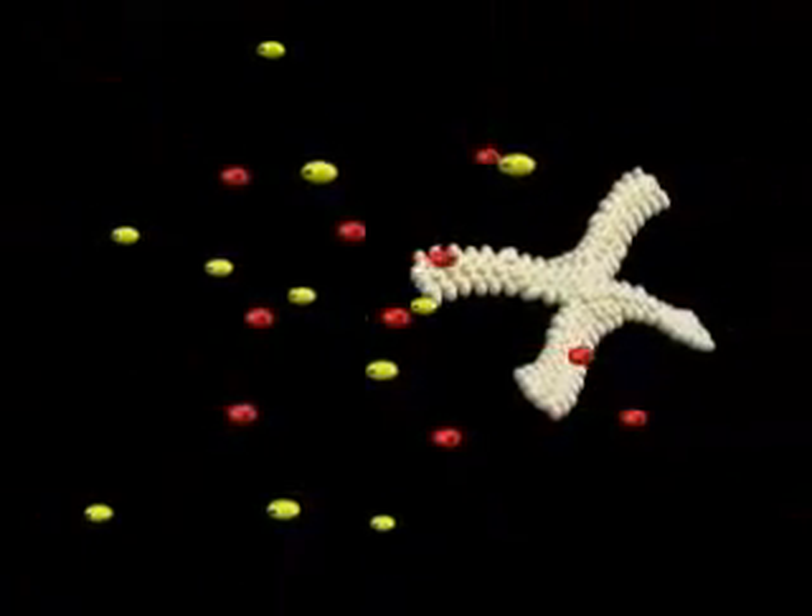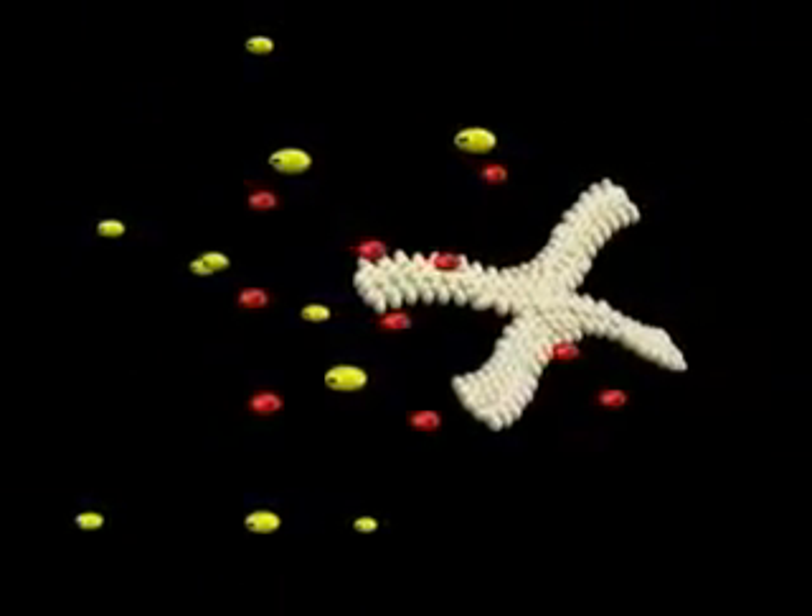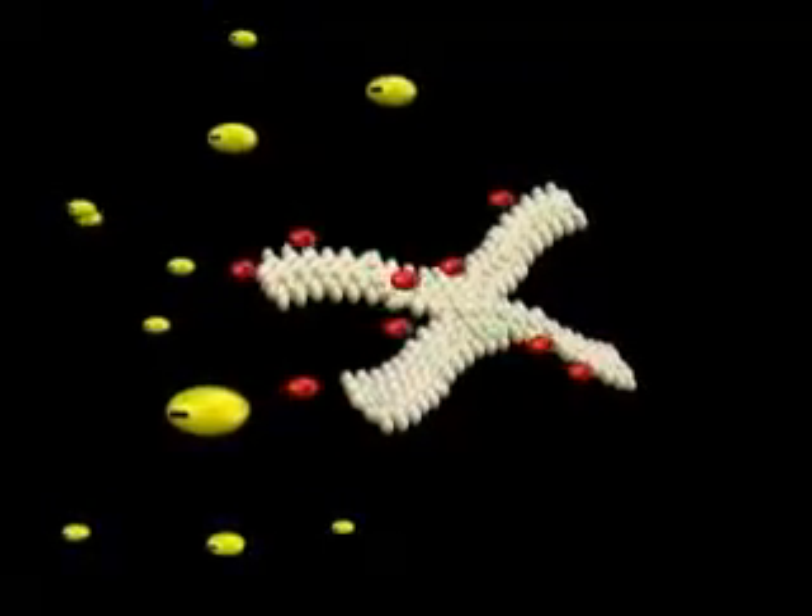The chromosomes are constructed from tightly wound DNA. The sodium chloride ions interact with the DNA causing it to relax and unwind into long strands floating in solution.